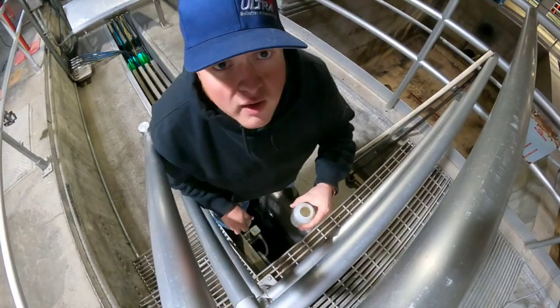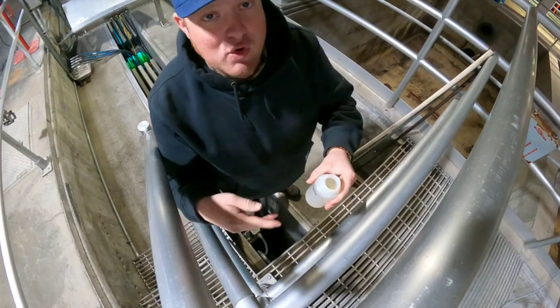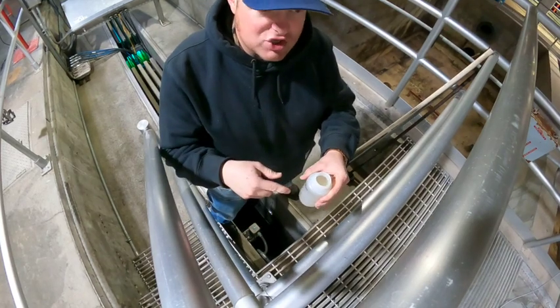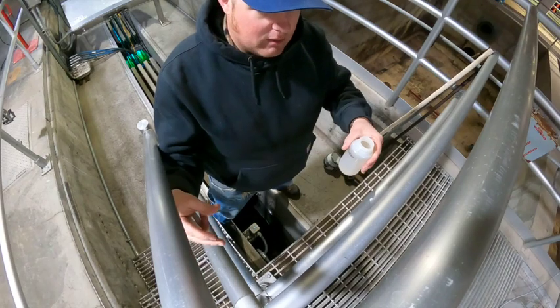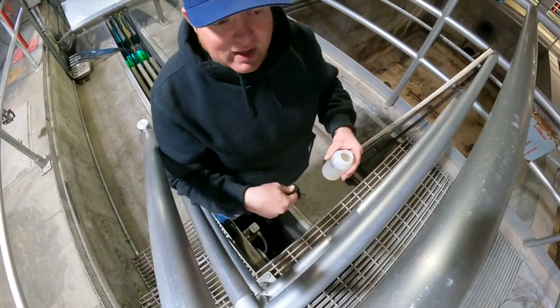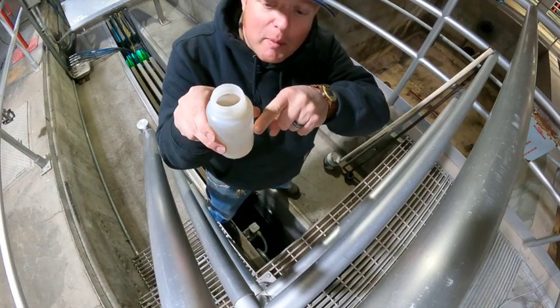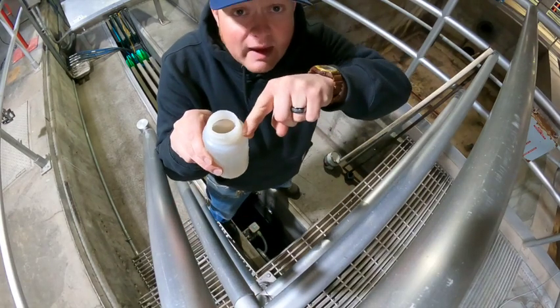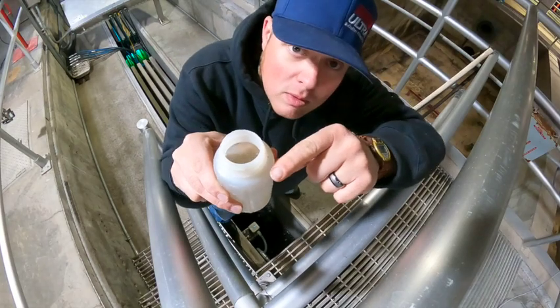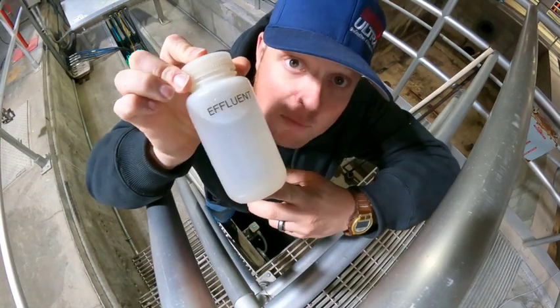Now, EPA has a very distinct method for collecting samples. Everything that we do here has to be consistent and has to be the same, to all match as closely as you can, including the atmosphere you take them in. I'm rambling, and when I'm rambling, I start forgetting words. But anyway, EPA says when you take a sample, the sample bottle should be filled to the neck where it goes on this radius. So, pour a little out, we're good to go. Effluent sample, ready to go.